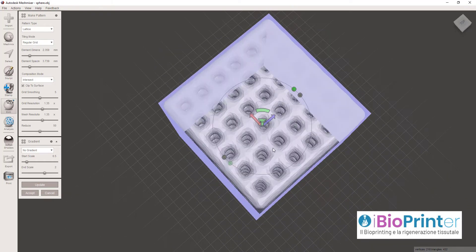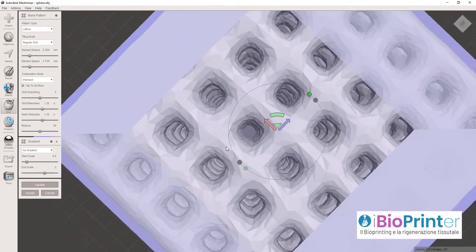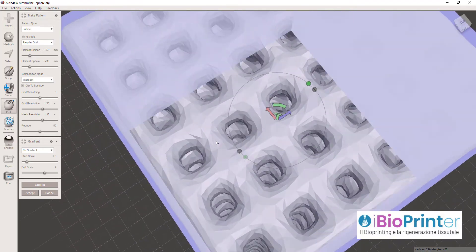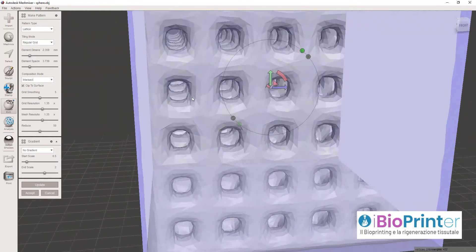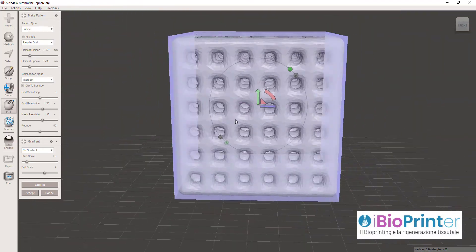Ecco qui, vedete la stessa struttura, però invece di essere una struttura positiva, è una struttura negativa.